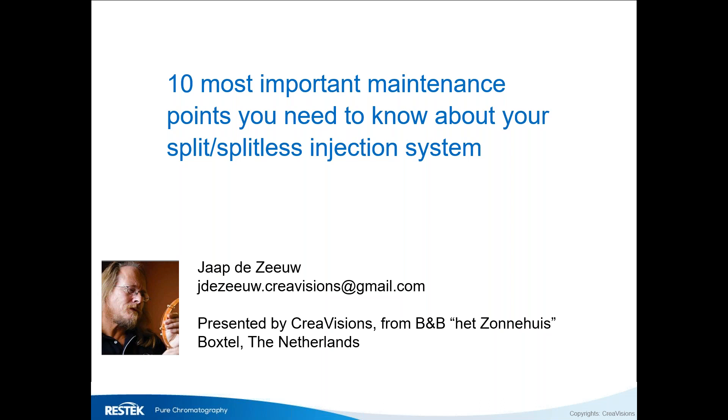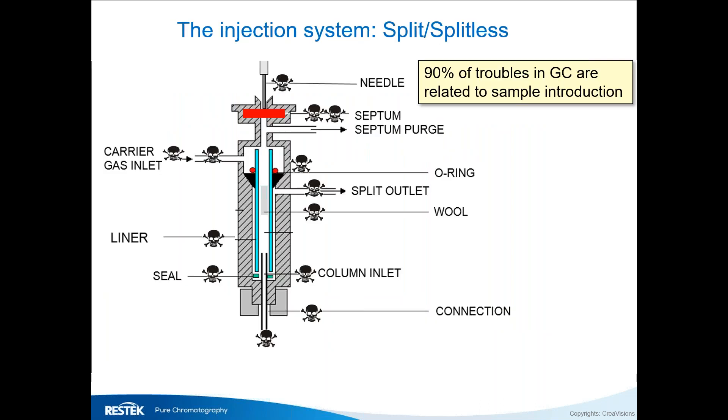Today we're going to talk about the most important areas of maintenance in split and splitless injection systems. If you look at the skull heads, you see there are a lot of areas where something can go wrong. Each skull head represents an area where something may go wrong, which usually is pretty obvious.